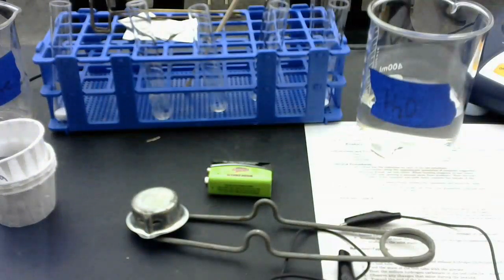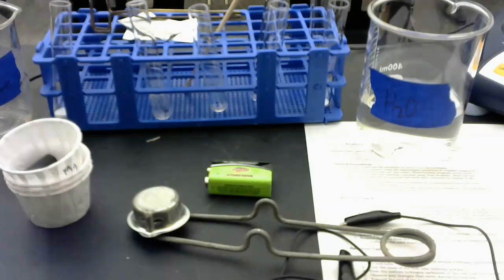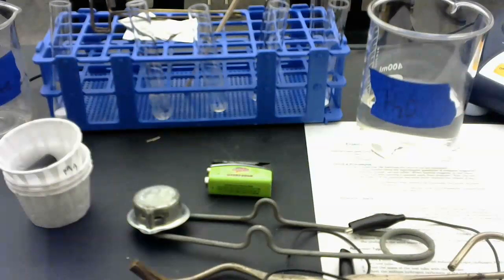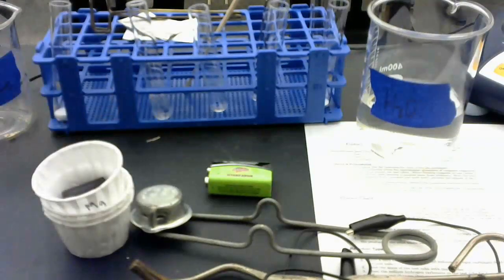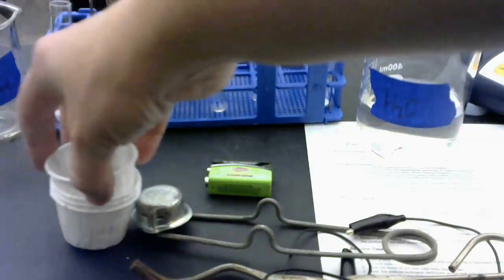This is going to be a striker. That's going to be to start your Bunsen burner. You're going to have a Bunsen burner. I have my Bunsen burner right over here. And then you're going to have some tongs right here. That's going to be to hold different materials that are going to be burning. And then you're going to have a stack of little cups. And each little cup is labeled, and it's labeled in order.